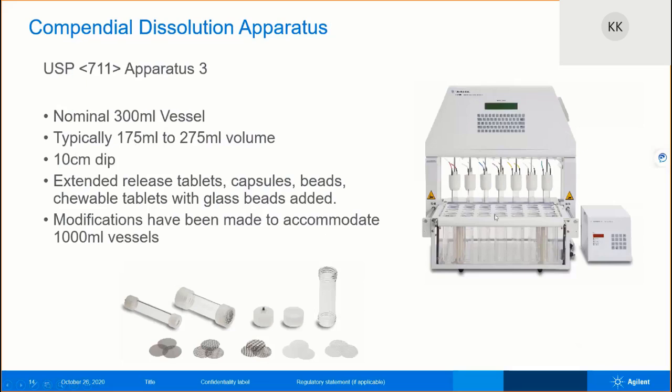And you can see already the major difference in the instruments is you're not stirring a paddle or a basket, but you are dipping up and down, right? Very different motion. You can also see that you're not just staying in one vessel, so to speak. Of course, you can do that. You can run your whole dissolution test in just one row.